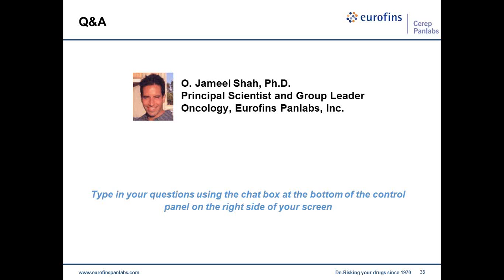You're also going to have heterogeneity in expression across a single spheroid, more than likely. Measuring RNA expression at the end of the assay is not something that we do, but we might be able to provide clients with samples that they could then submit for RNA expression profiling later if that was of interest.